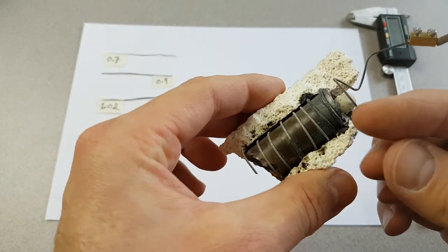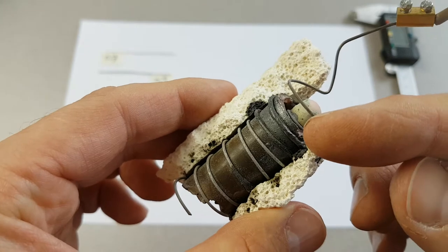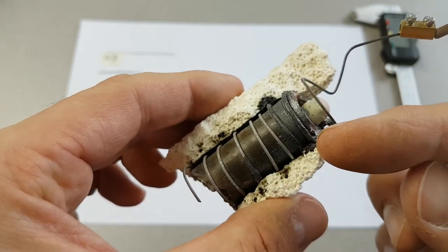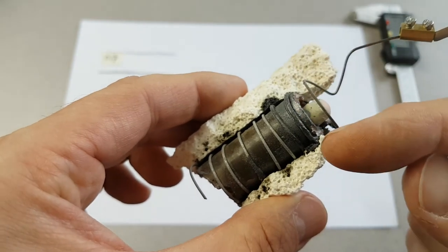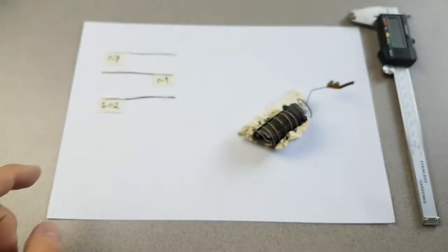The material in question is probably this kind on the end here. We discussed it in the presentation. The idea is to take a section of this, of a known weight, and compare it with a section of unused wire.